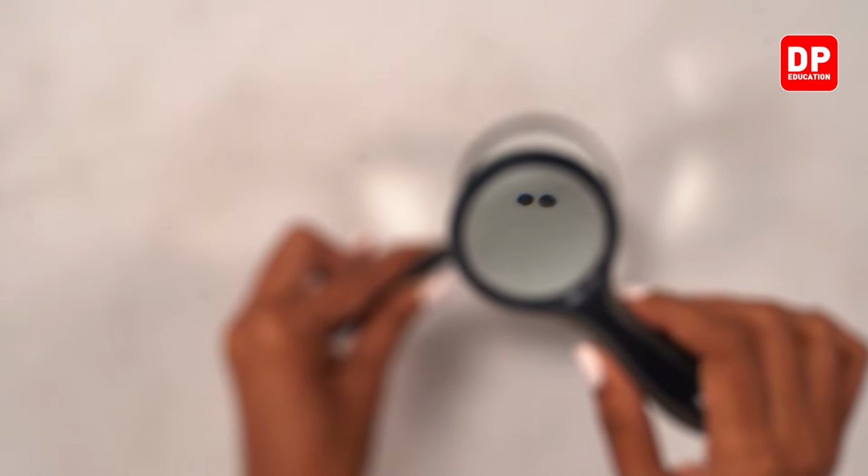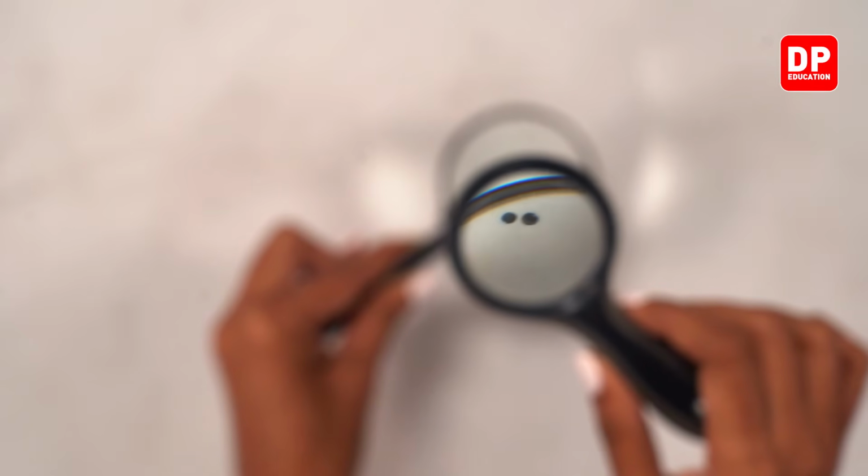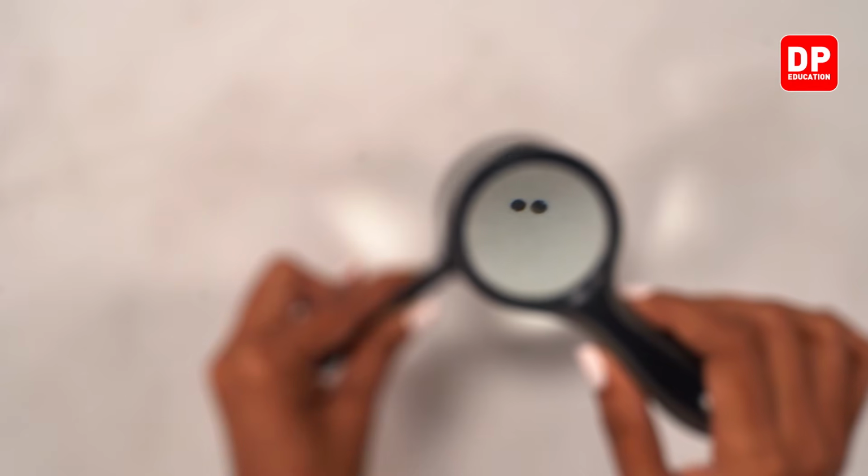Right. What can you all see, children? You all can see that the distance or the gap between the two dots is higher this time when we use one hand lens, right? What can you tell about the magnification? The size of the image is also bigger, higher than that of the first hand lens.